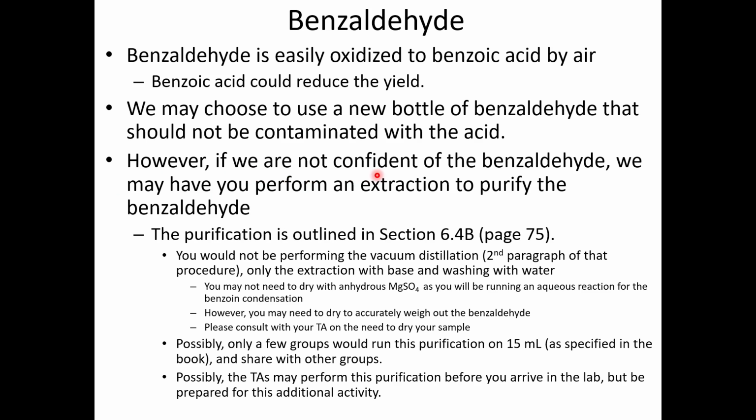However, if we are not confident of the benzaldehyde, we may have to perform an extraction to purify it. We already did this in the first lab, so you are using in this experiment a purified benzaldehyde that you did in the first experiment of the whole semester. So this is the page where you can find the purification of this material in case you need to check something.